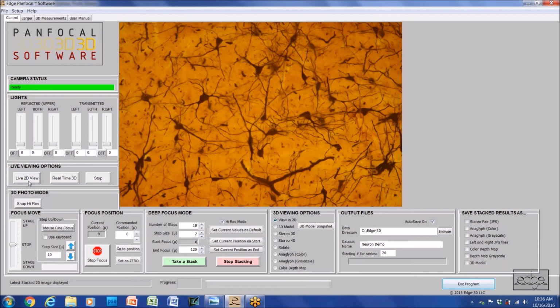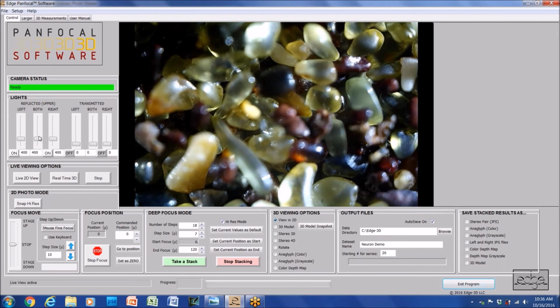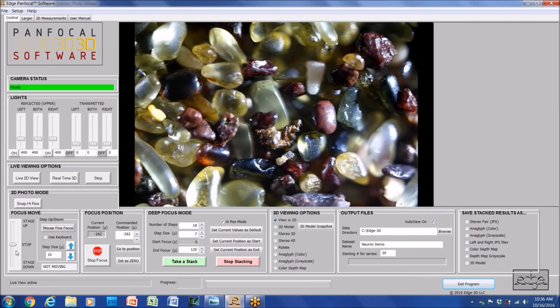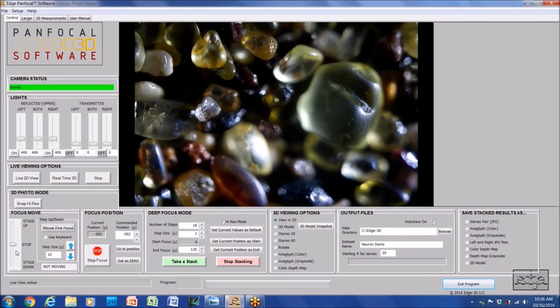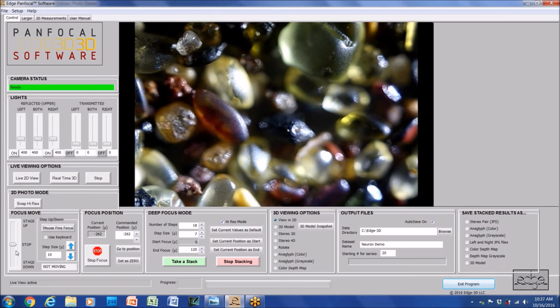So right now I'm going to go to live view, and now I put a different specimen in there. Now I'm going to put on the reflected lights. There's the reflected lights coming on, and there's some sand. I'm going to lower the stage because this is a thicker specimen. As I lower the stage, you'll see the individual grains of volcanic mineral come into view. I'll move the stage around a little bit and find a view to show you what it will look like when I stack the images. So here's an interesting little view here.